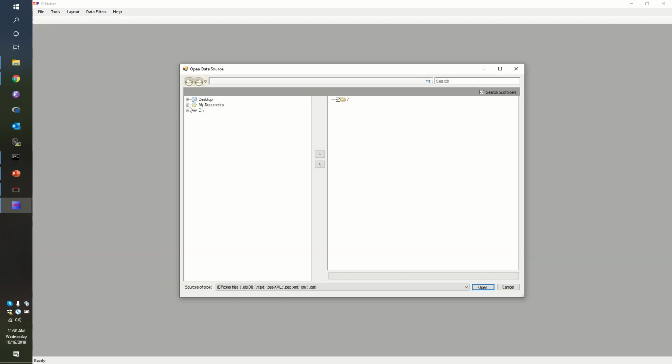I'm going to import these results for the search. So if I import the files, I go to the C drive, to the FragPipe tutorial, and now I want to go into my result search only directory. I need to specify that I want to search subfolders, because you remember those pepXMLs are not in the result directory.